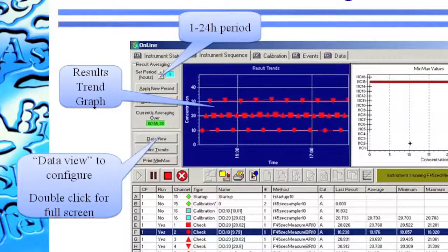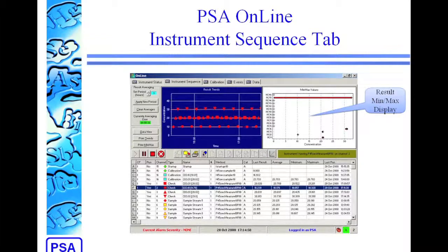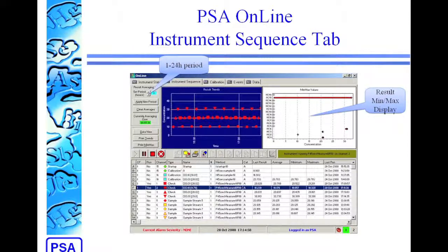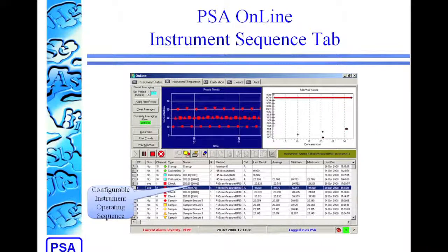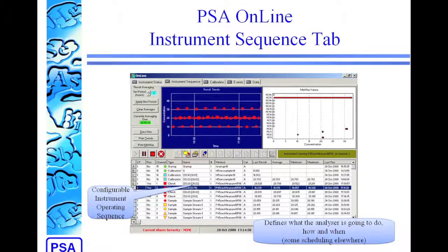You can also double-click on the graph to bring it up to full screen so it's easier to see. Over to the right of the page, we have the result min-max display, where the last result on each channel is shown with a little black plus sign, and the minimum-maximum range over that same 1 to 24 hour period as the results trends is shown by a red bar. At the bottom of the screen, we have the instrument sequence itself. This is highly user configurable to set up how you want the analyzer to operate.